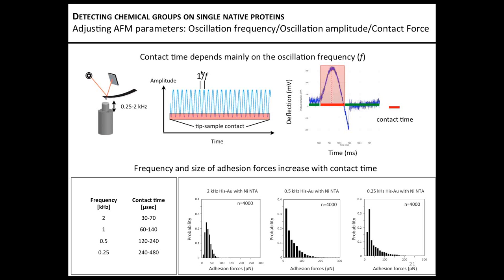I don't know for you, Moritz. Yeah, I think at half a kilohertz you can also go to a 0.25 Hertz scanning rate. Somehow you need double as much time as you would need for the same pixel resolution if you record the PeakForce map.